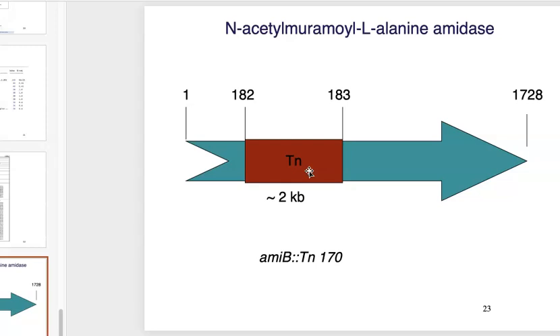The bottom line is this transposon insertion hit fairly early in the gene, and the reason why we might want to know where the transposon inserted is, again, to figure out whether or not we can expect a full mutation or a partial expression of the gene. Imagine if this transposon inserted way back here and disrupted the tail end of the gene.